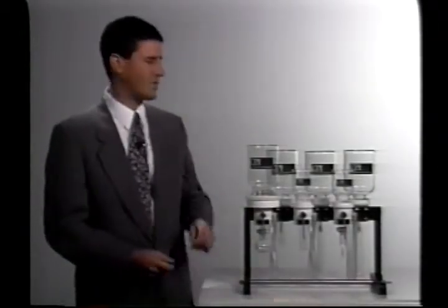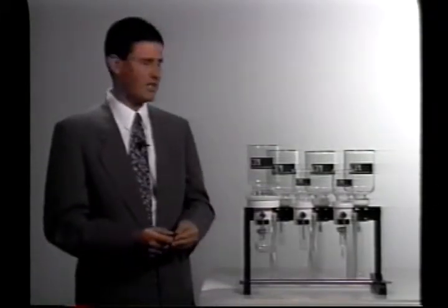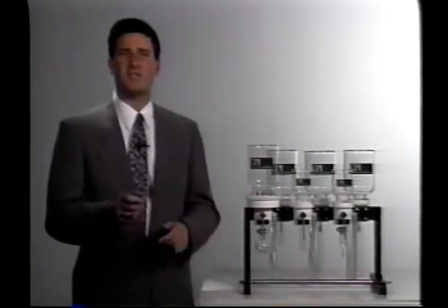I'd now like us to take a closer look at how easily you can switch the sample reservoirs, how quickly and easily you can convert a forty seven millimeter position to a ninety millimeter position, and also to take a closer look at the different options you have as far as collection vessels.